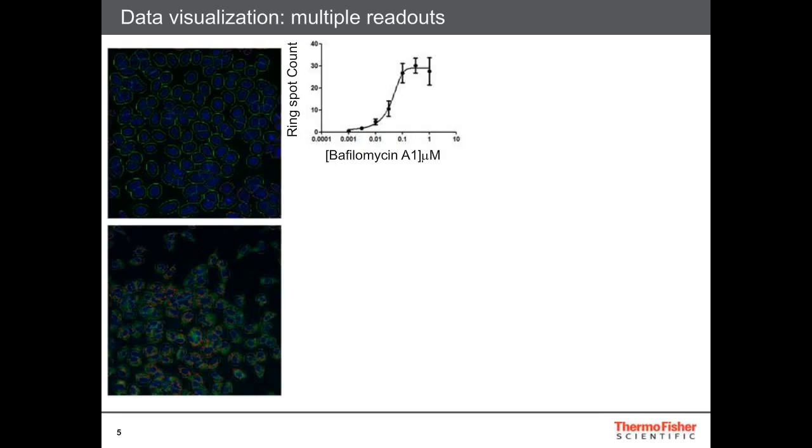This is a dose-response curve. This is 7 concentrations of the vacuolar ATPase inhibitor bafilomycin A1.